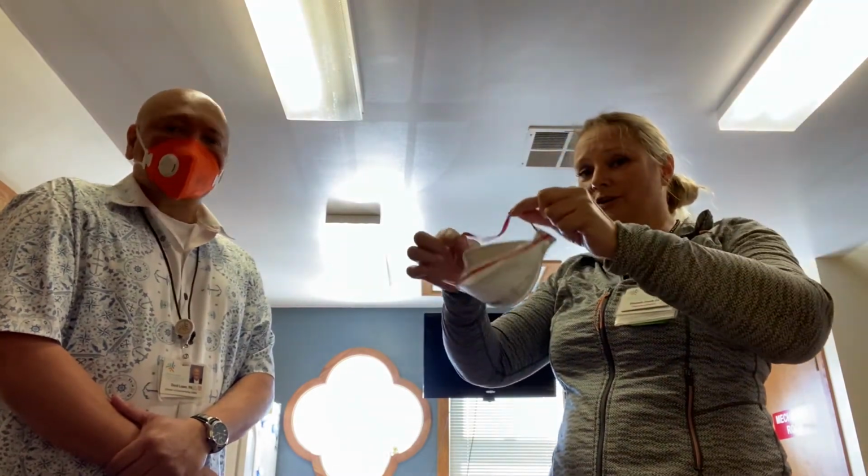Hopefully, this helps you. One thing about removing the mask, don't touch the front, because that also is considered contaminated. So you always want to grab the straps and you start at the bottom one first. You take that one off because that leaves it in place. And then you take the other strap off. And that's how you take it off. You don't touch the mask. And discard of it appropriately. And then put your other mask on, so that way you're not breathing all over. And then everybody, sanitize again.